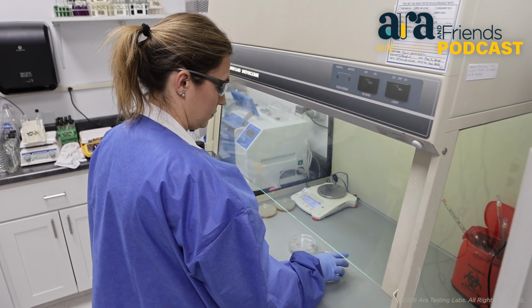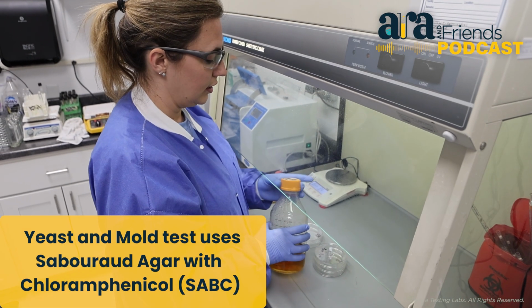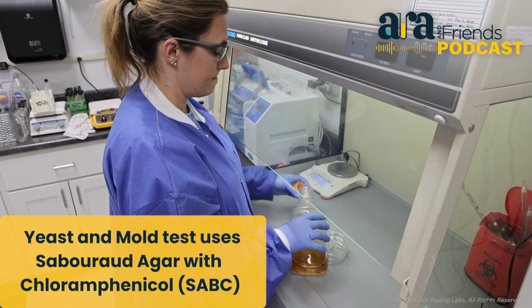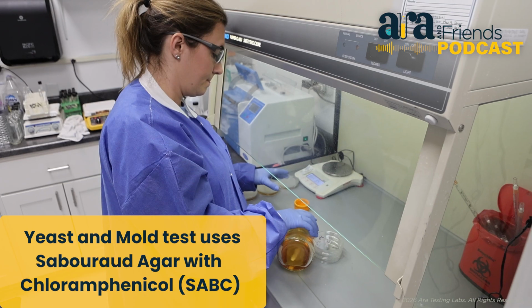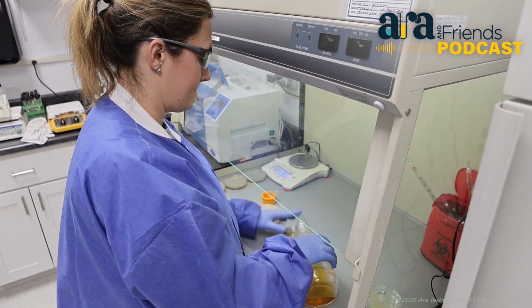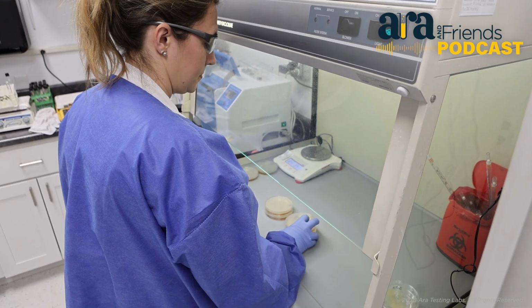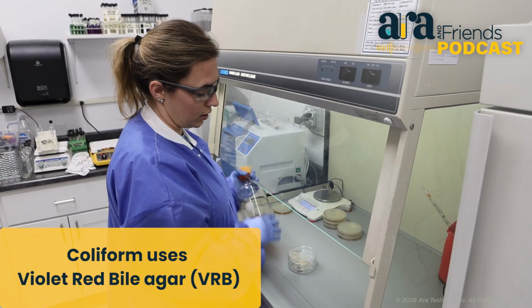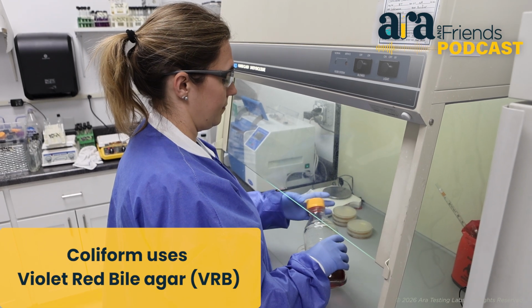What's the next agar? This is for yeast and mold. This is an SABC. It's a sabouraud dextrose agar with a chloramphenicol. Now we're going to do our coliform USP agar, which is VRB, violet red bile agar.